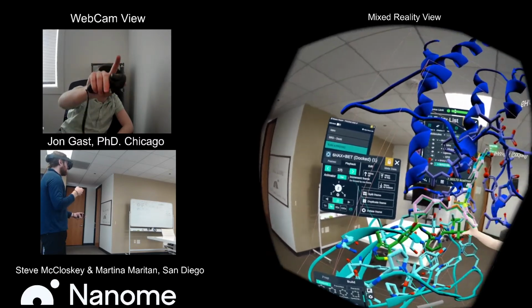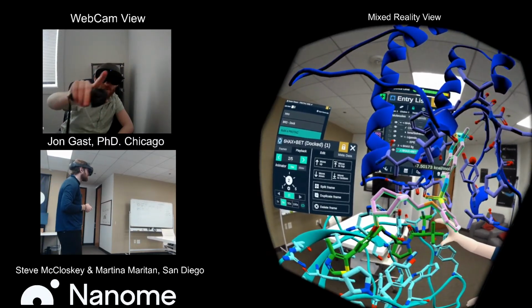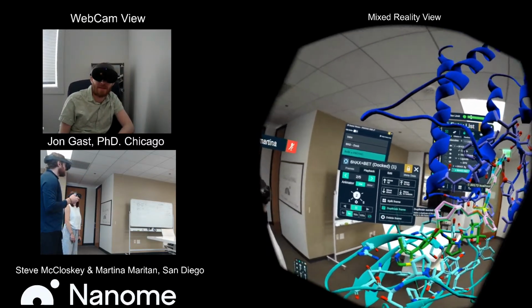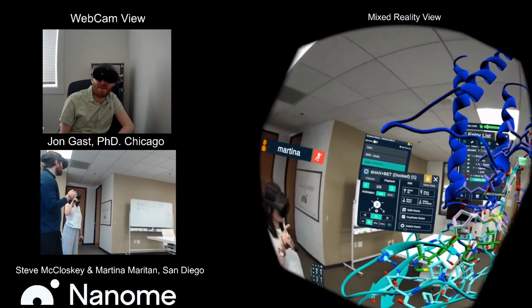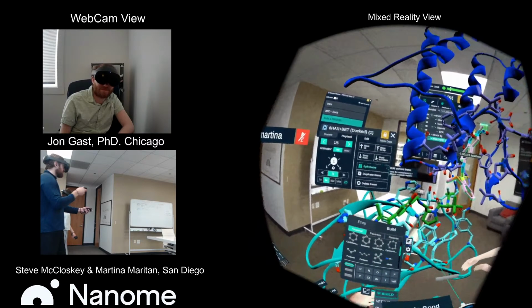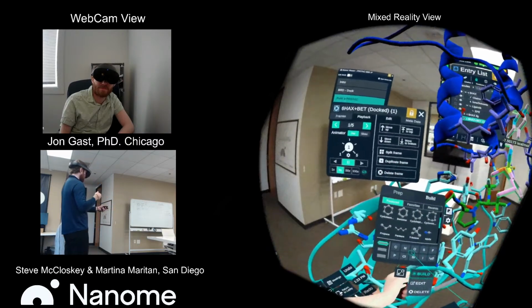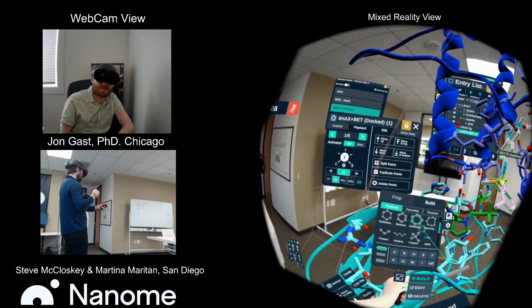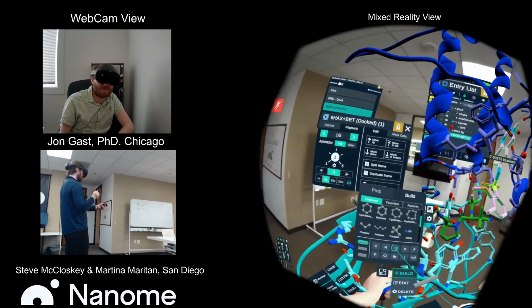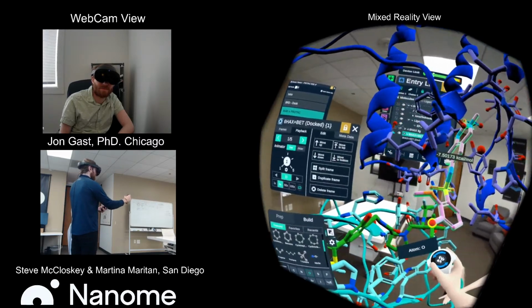Let's try branching off. We can also, on the next one, maybe even branch off from a different member of the ring, or we can also connect to different points too. Really endless opportunities for how we might rethink our linker. Okay, let's try that out. So instead of going off of the same position that I keep going off of here, maybe we could just make something else. And let's see, maybe we'll go with a PEG again, but this time it'll be a little bit of a different one.